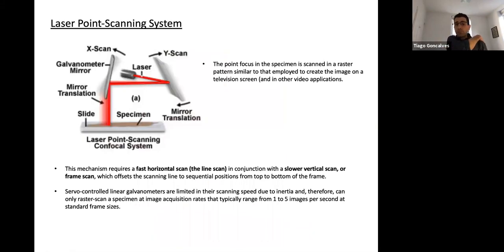Laser scanning. There's fundamentally two different ways. Well, there's more than two different ways. I'm actually not talking about acousto-optical deflectors, which are still a different way of scanning. I'm only talking about mirrors. There are other techniques that do not even involve mirrors, and they're very fast, and they're great for accessing random points in your sample at any time.